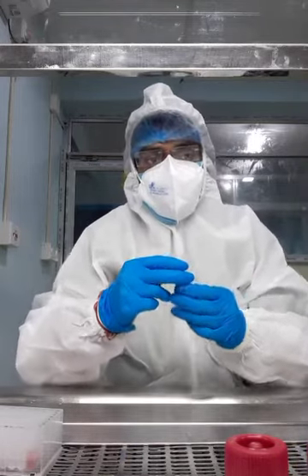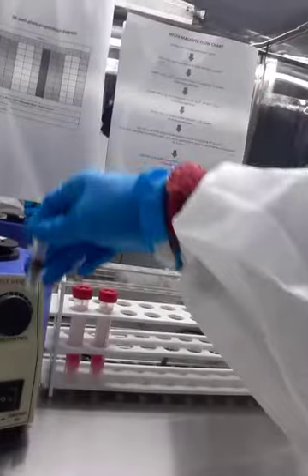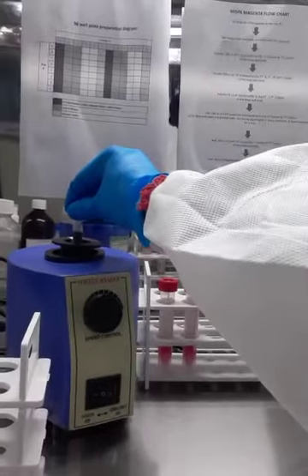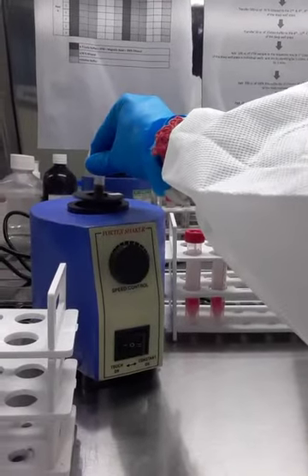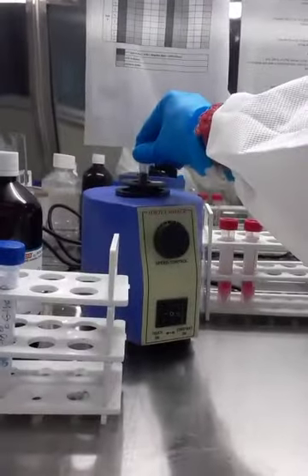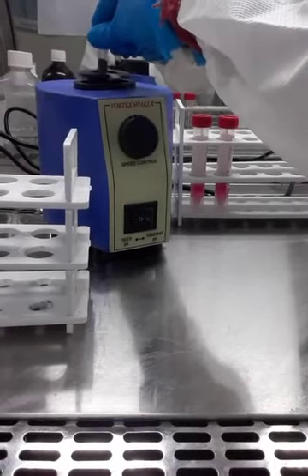This is the magnetic bead I already showed you in my previous video, and this is the vortex mixer. It is already turned on, so you have to put it and press. When you press, it automatically shakes. I think you are able to see it. It's already shaking.